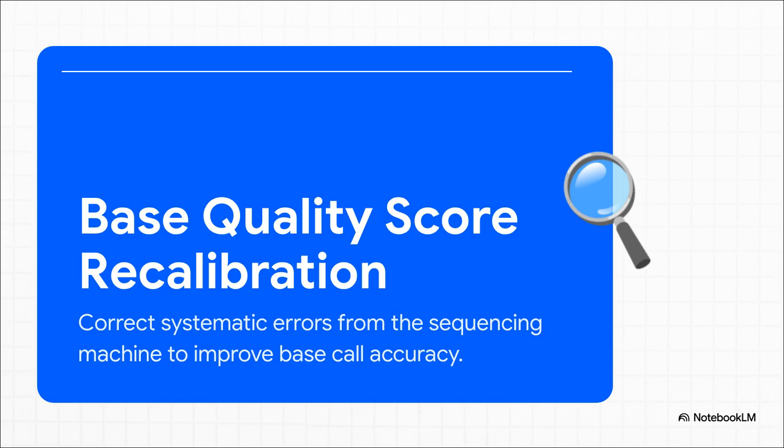This is, believe it or not, a machine learning step. Sequencing machines are amazing, but they're not perfect. They have their own little quirks and make systematic errors. What BQSR does is it builds a model of those specific errors and then goes back and adjusts the quality scores for every single base in our data.